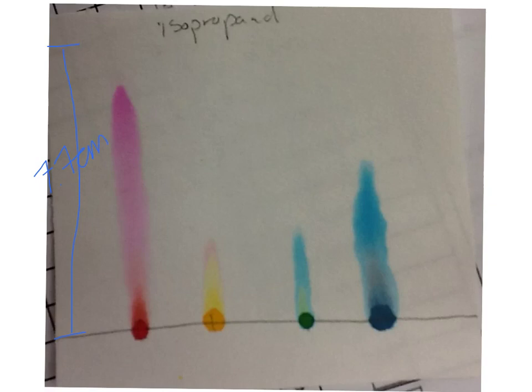Now, the next thing we're going to do, we're going to look at the yellow compound, okay, so the yellow dye. If you look, there's kind of a mark that's right here in the middle. It's a little bit darker. That would be the middle point of this yellow peak. So you can see the yellow peak goes up to here. And then we have the red peak that goes to about there. So what we're going to do is measure from the middle of here all the way up to that point right there.